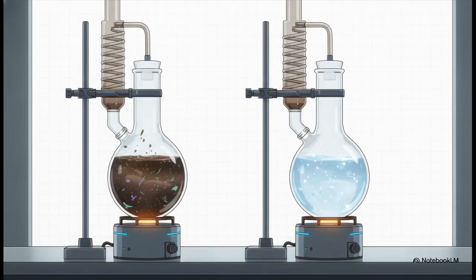Now, any good chemist knows you absolutely need a control. Enter the blank determination. This means we have to prepare a parallel sample using pure, clean, distilled, or deionized water instead of wastewater, and we digest it under the exact same heat and acid conditions with the exact same reagents. This gives us a baseline of how much dichromate is present when there is literally zero organic pollution in the flask. We absolutely need this baseline to accurately calculate the mathematical difference later on.